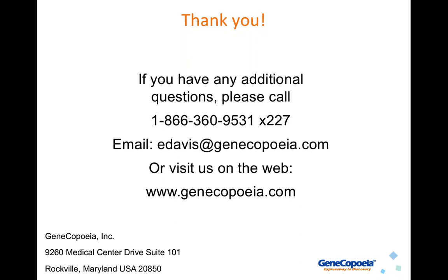Okay, next question. When sorting single cells by flow cytometry, do you recommend some staining to differentiate live or dead cells? No, that's probably not necessary because you're going to grow these out anyway. I mean, if you saw a lot of cell death, maybe, but I don't think that's really necessary. I think you should just sort the cells and then try to culture them, maybe in 96 well plates, and anything alive will grow up and anything dead will not. But it's a good question.